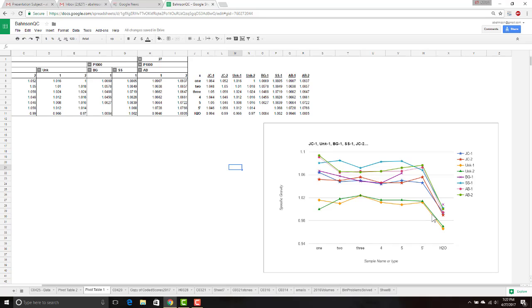So there is a logic and a stepwise progress of change that should go from higher to lower and then a little lower. So that's kind of odd. Maybe the bubbling of the yeast in this sample tended to throw some evaporation out and make it a little more concentrated. If my precision was good enough, this might be significantly increased. But these are replicates, so the fact that they're all this different, to me, would indicate that the bubbles of the carbon dioxide coming out from the yeast acting on this might be making my precision worse.